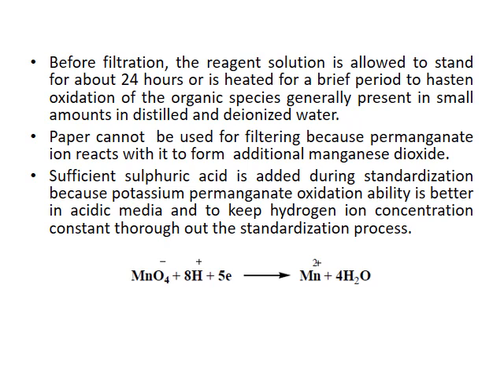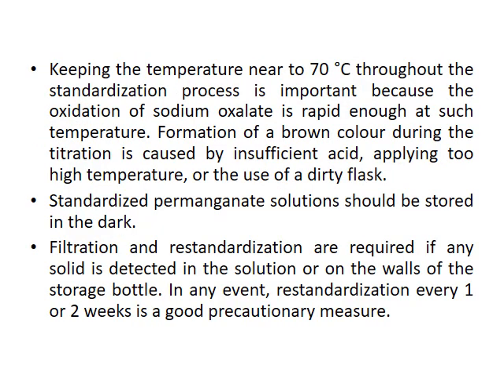The H2SO4 acid increases the oxidizing ability of KMnO4 and provides protons for the medium. Keeping the temperature near 70 degrees centigrade throughout the standardization process is important because the oxidation of sodium oxalate is rapid enough at such temperature.